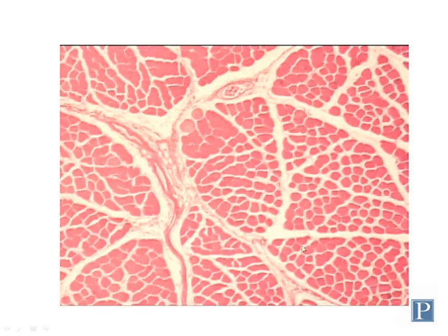So here we have several fascicles of skeletal muscle. This is all one fascicle right here. Here's part of another fascicle, here's part of another one, and here's another one, or this fascicle might be part of the same fascicle. It's hard to tell. You can see here where there appears to be some separations between the muscle fibers. These are not independent fascicles. This is just where some of the muscle fibers are kind of spreading out after they've been sectioned.